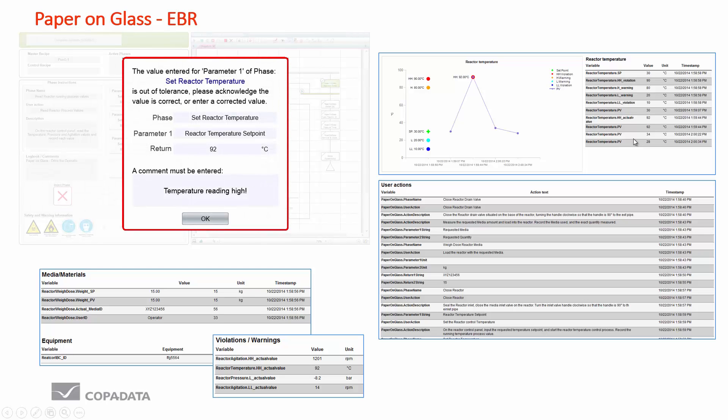We also have this point of entry verification. Here is an example screen where the operator has entered a value which is out of the tolerance for this particular quality attribute. It asks the operator are you sure about this volume and a comment must be entered. So even if the value is true, if it's a violation or it's a warning, a comment needs to be entered.